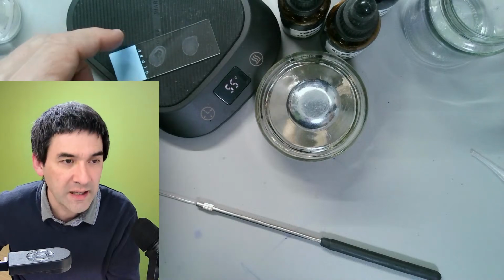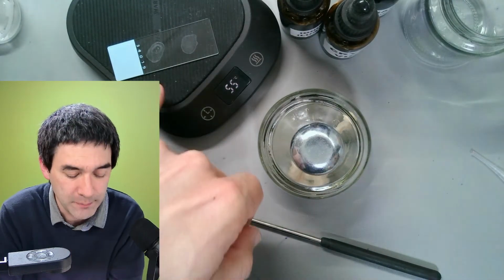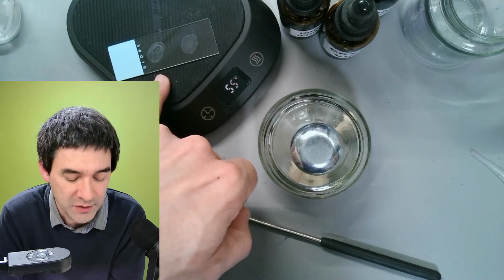Now, when this is completely dry, it has to be heat fixed. It's important that you do not heat fix it before it's dry. That's important, otherwise the cells are going to pop open and it's not going to work.